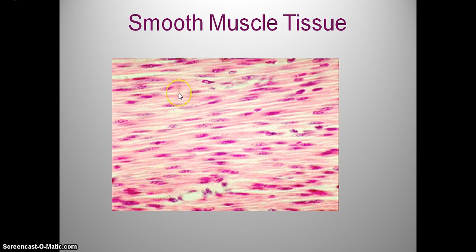These muscles are needed so that function is taking place, so that food, whenever you eat it, for example, moves down through peristalsis, movement of intestines.